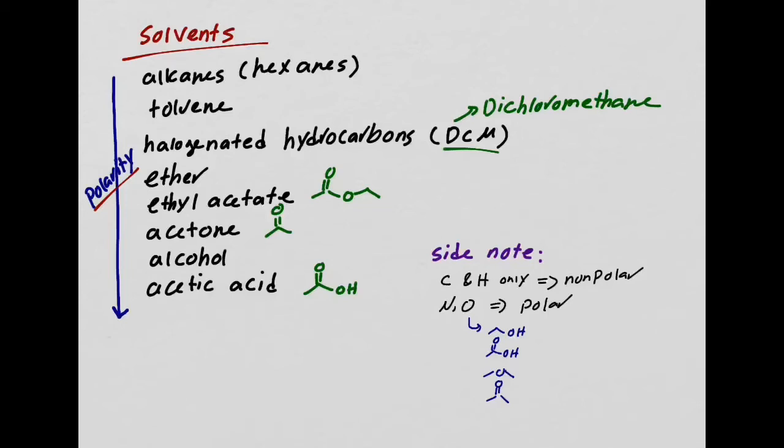So far so good? Okay, so these are the common solvents. Know the solvent, know the structure, and you can also look at the polarity based on this. You see OH, oh, that is pretty polar. You see nothing but carbon and hydrogen, like here, that is pretty non-polar. Okay, so hopefully you got the solvents down.